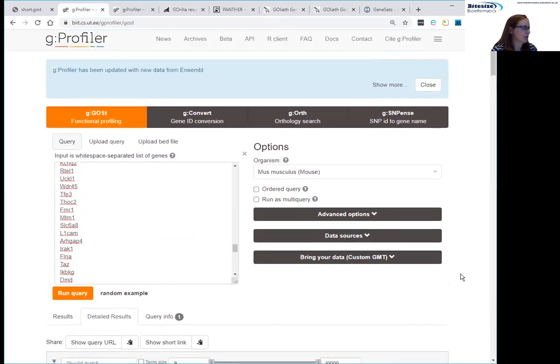That seemed to work quite nicely. I think there are a few of them around. I mean, the actual analysis isn't too complicated. It just can change depending on the functional sets that are used. But hopefully, you should see that with whatever package or tool is used, if the results are highly significant, then they tend to be very similar across the different tools and packages.